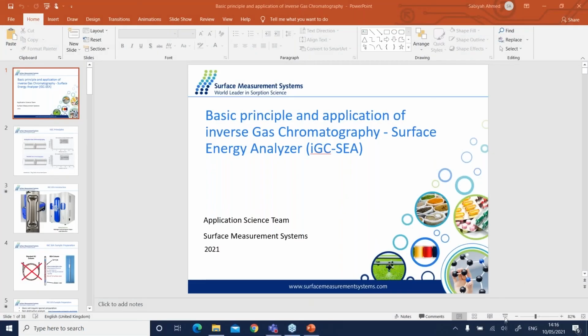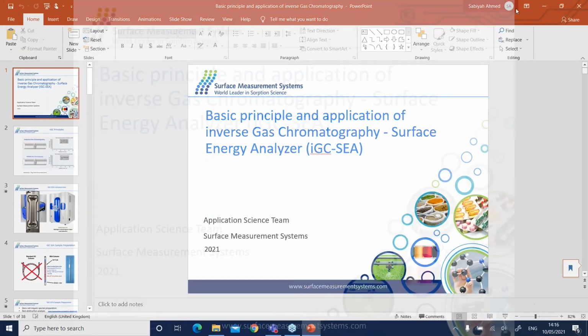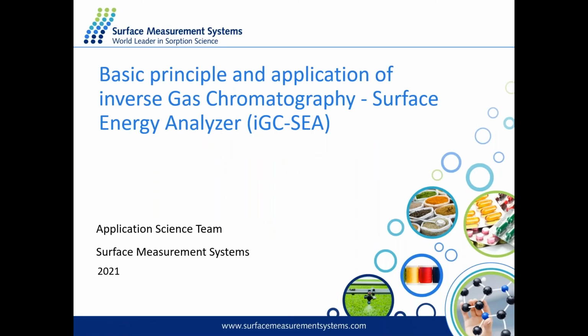Thanks for the introduction, John. I'm just going to share my screen with you all now. In this presentation, I'm going to go through a technique that's a little bit different. It's regarding the IGC SEA, the Inverse Gas Chromatography Surface Energy Analyzer. I'll go through what the system looks like and what it does, and a few case studies with regards to food applications.